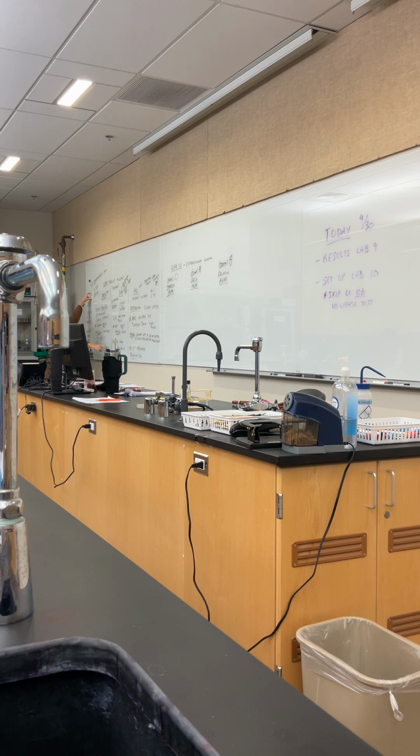What do we talk about here? The dyes. The dyes are going to kill all the gram-positives. So if I see growth, that tells me it's a gram-negative. If it's not growing, that tells me it's a gram-positive. See how we can use this? It kind of helps us, right? So this is a way that we can verify that our original gram stains were correct.